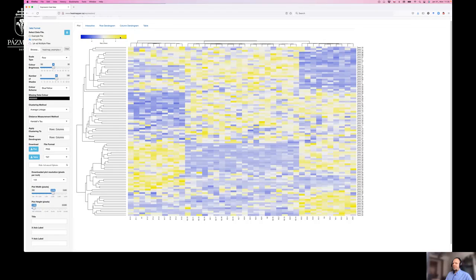Okay, so let's move on. How can we choose an appropriate metric or clustering approach? Basically, what I would like to say is it depends on the actual application. So choose whatever is suitable for your application.